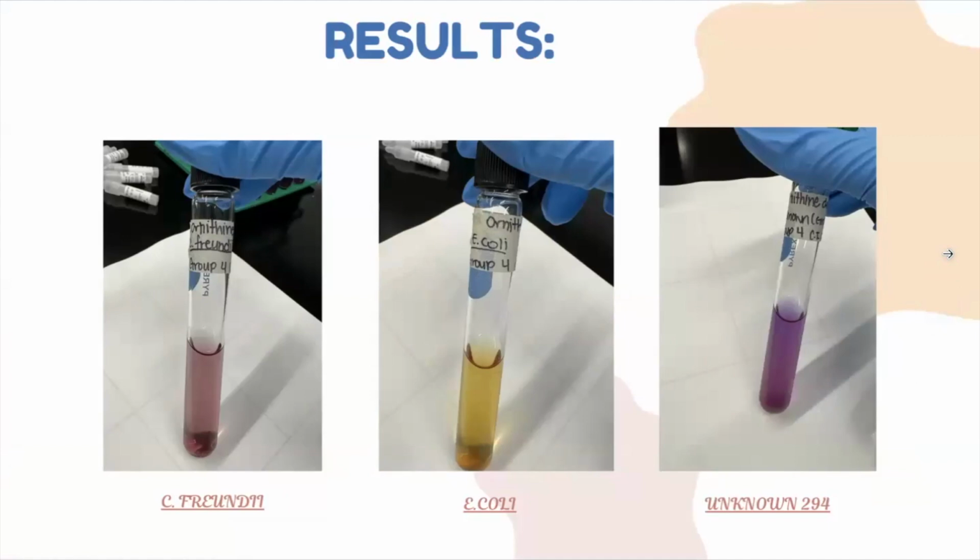For our ornithine decarboxylase test, for C. freundii, we got a negative result, which just means there's no ornithine decarboxylation and the medium stayed acidic. For E. coli, we got a negative result, which just means acidic pH from glucose fermentation. There's no alkaline reversion. And for our unknown, we got a positive result, and this just means that the ornithine was decarboxylated to putrescine, and the alkaline pH is restored.